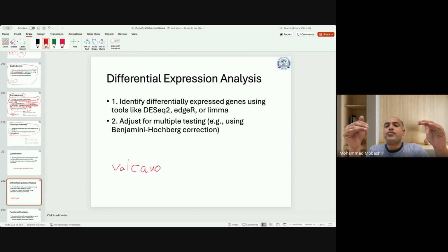That means the genes which are expressed in normal tissues and the genes which are expressed in cancer tissues: how many times they are bigger or lower than each other. So this is how you calculate fold change. You can do it using your own basic mathematical formula, and then you choose a plus or minus threshold value, let's say 2.0. This is the fold change threshold level.